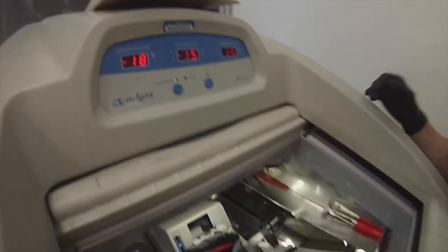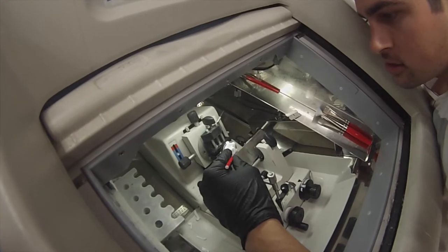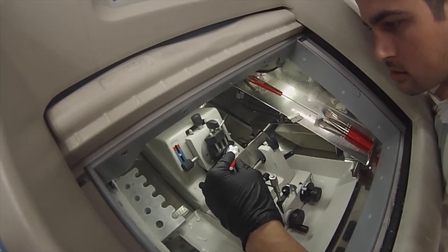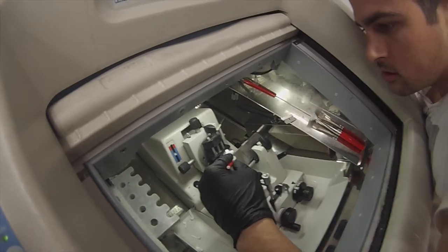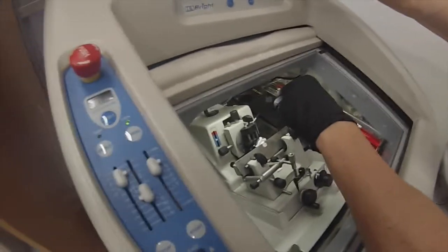We're cutting at minus 15, which is an ideal temperature for thymus. You heat up the blade with your breath so it has a sticking surface when you slice the sample. You guide it with a brush and you rest it on the cold blade.